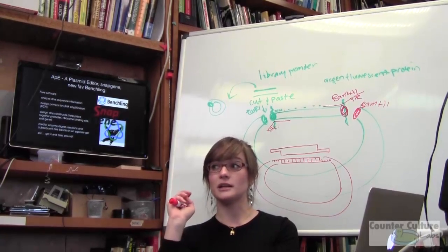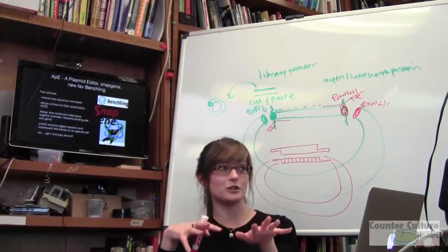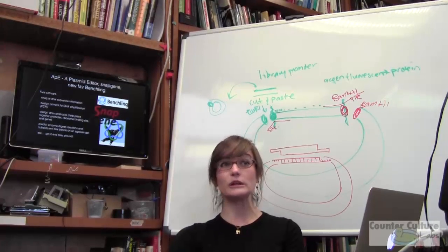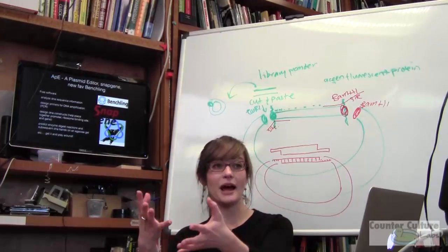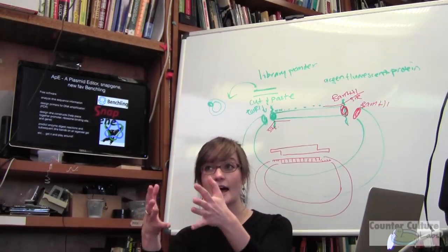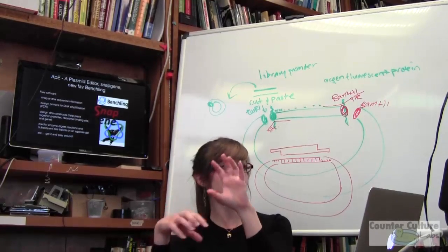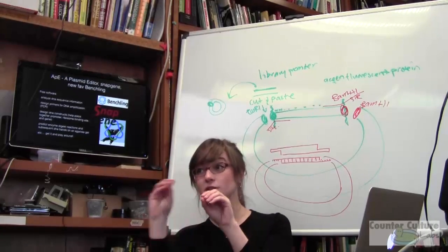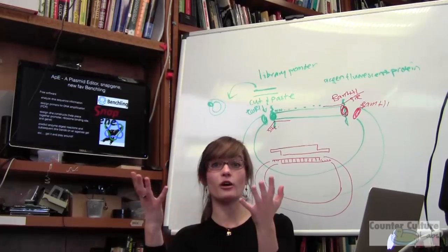And they keep all the information on their database or on a server, and nothing's actually on your computer, which is really nice. It frees up a lot of space. But what's really wonderful is that you can enter all of your DNA information, like you have a plasmid that you're using and you put it up there and it's annotated. Every modification you make to that vector, it logs it, so you can see every iteration of your vector all in one place. You can link it to literature resources, you can link it to a piece of data, and you can share all this with someone else.